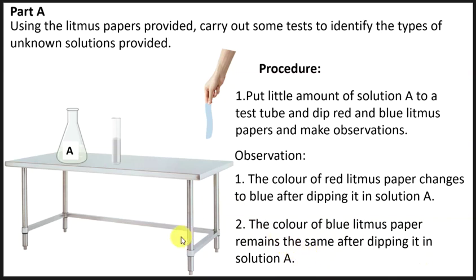Okay, so with practical, never go with answers in your head. You write what you observe while doing the practicals or the experiment. So as we have seen, the color has remained the same.